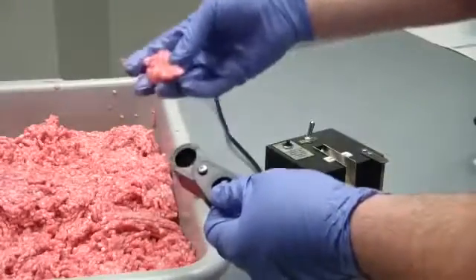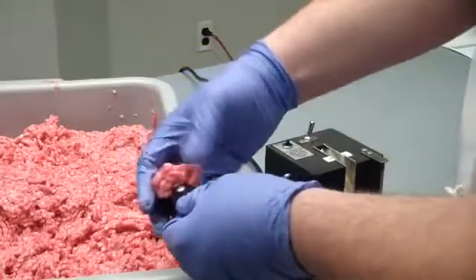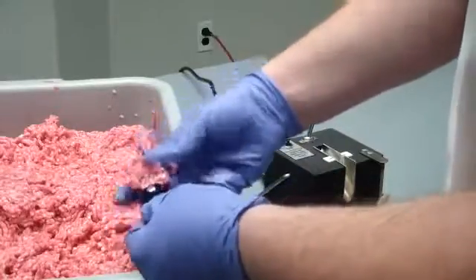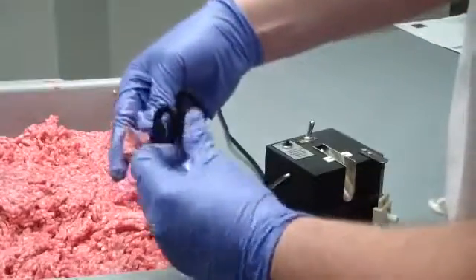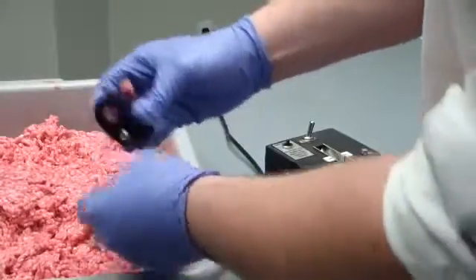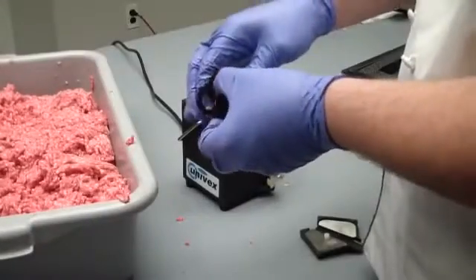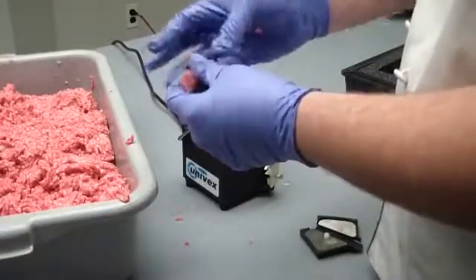Once you have your meat samples from different areas of the tray, you can pack it into the holder until it comes out on both sides, and then swivel this around to cut all the excess off. Once you have measured your amount of meat, you can use your pinky to push out the sample.